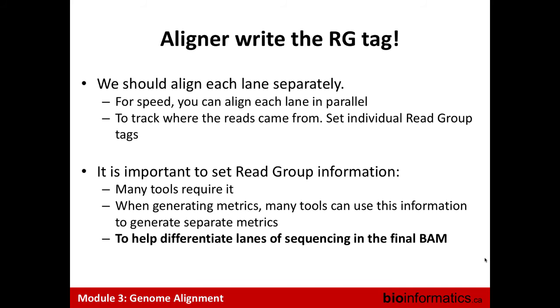So for human genomes, usually I end up with around, after trimming, so when I count from the reads that I give to the aligner to the reads aligned with high quality, I get between 95 and 98% of my reads that are aligned.